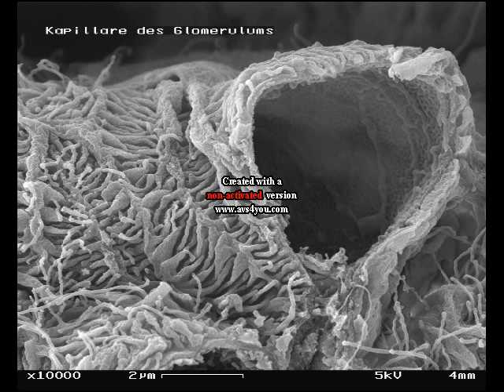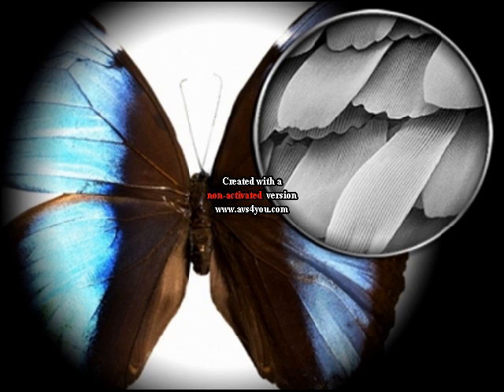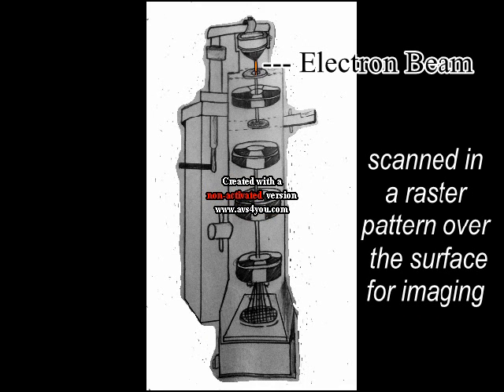Just like in this picture, the glomerulus of the mouse kidney is showing a broken capillary. If a researcher wants to increase the magnification of the butterfly wing, he or she simply sets the electron beam to scan a smaller area of the sample. The electron beam is scanned in a raster pattern over the surface for imaging.